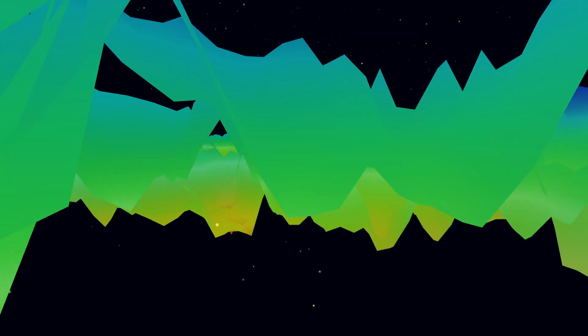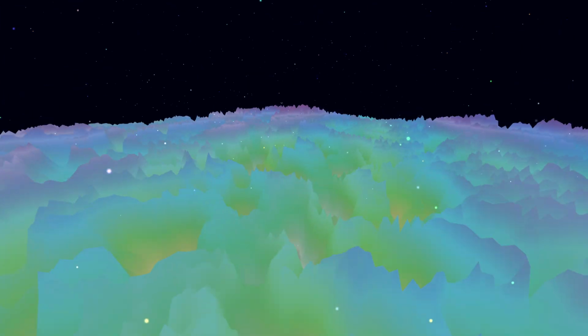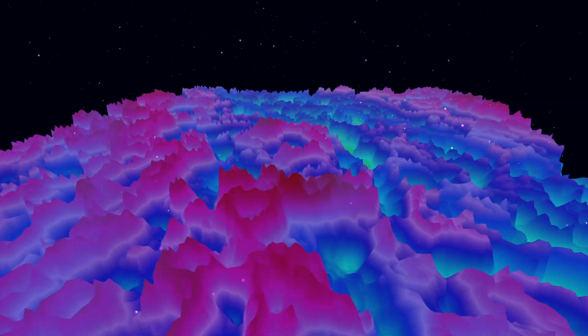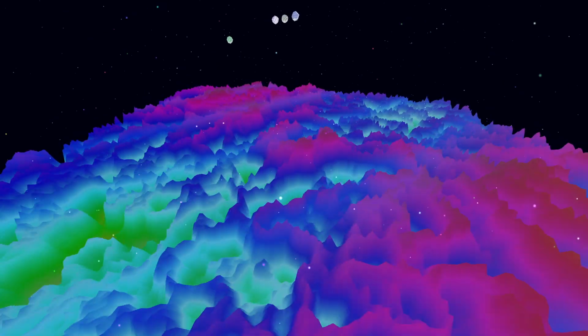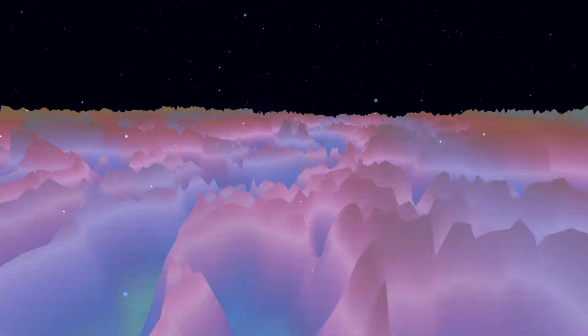You also mentioned Auger peaks earlier. What are those? Ah, yes. Auger, pronounced "OJ" electron emission is a different, secondary process that happens after a core electron is initially knocked out in XPS. An outer electron drops down to fill the core hole, and the energy release can kick out another outer electron, the Auger electron. These show up in the XPS spectrum too, but at positions that depend only on the element's energy levels, not the incoming X-ray energy. They can provide complementary chemical information.